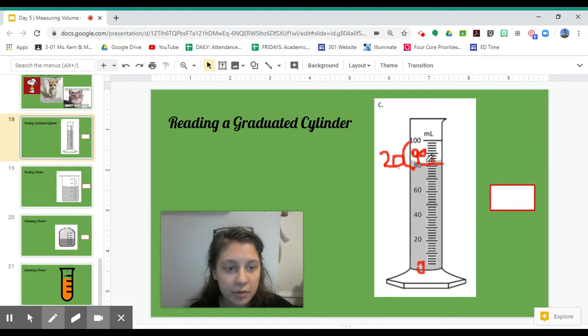We've got 90 here and 80 here. So the volume of this liquid is somewhere between 80 and 90, closer to 80. We can figure it out exactly because there are five jumps between 80 and 90. If I'm thinking about this like a number line, I have to go from 80 to 90—which is 10 numbers—but I only have 5 jumps to do it in. If I count by 1s, I would get 80, 81, 82, 83, 84, 85, but that doesn't match up with 90.